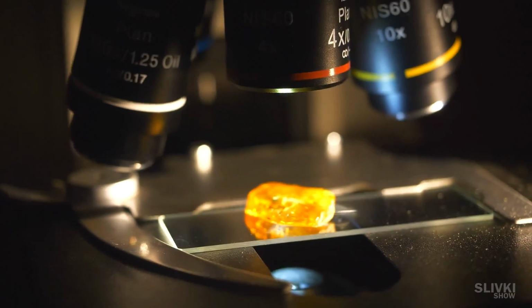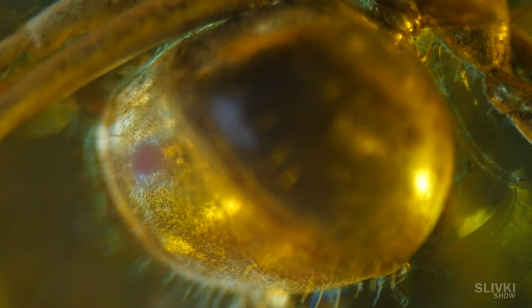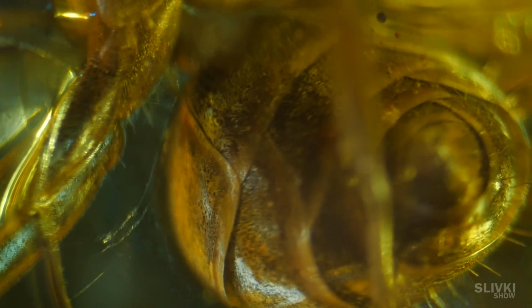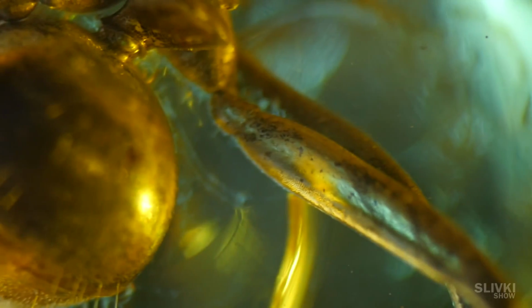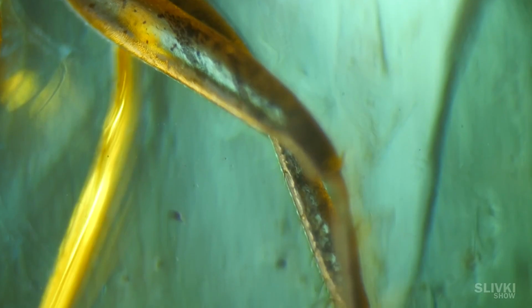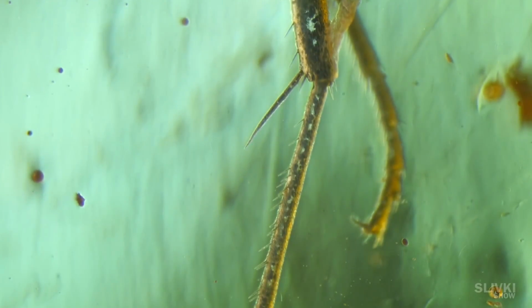We can see more under the microscope. Here is his belly on the other side of the scales and it resembles the tail of a wasp. But right here we see the hind leg, and it's not completely normal. We can see a large number of different points on it, which were probably needed for protection. I didn't see that on modern ants.